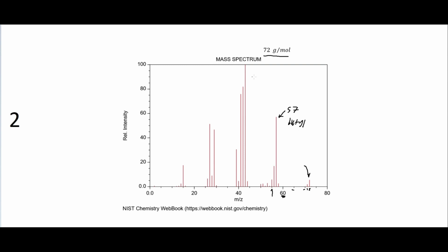Then we have our base peak right here at 43, so the m/z of 43. Then we can go 40, 35, to 30 right here, so we have another one at 29. Remember, this is our propyl peak, and this is our ethyl peak right here. Then it looks like we have one right here, which is 15, which is our methyl peak.